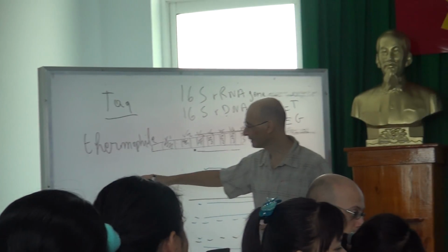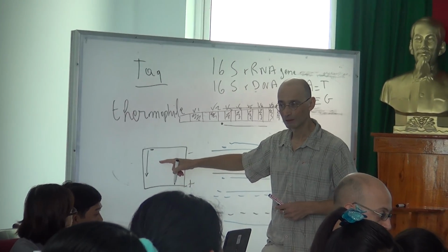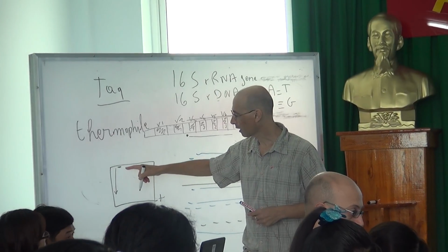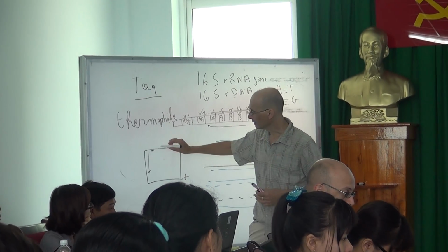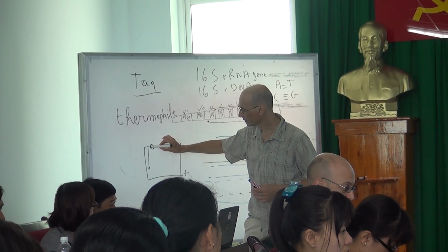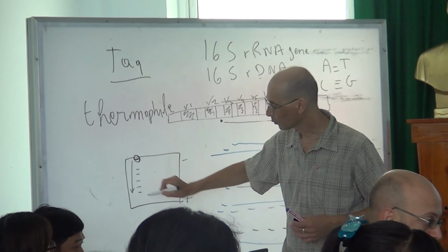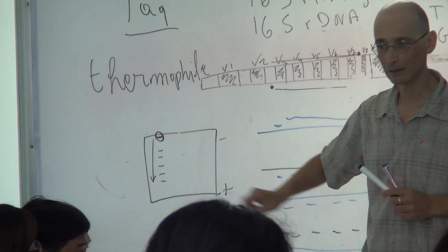In the gel you put your DNA here and it migrates down. What is the parameter that is looked upon here? What if you have different products in your here, what will separate them? Why would they be separated if you have different products? How does it work in such a gel?